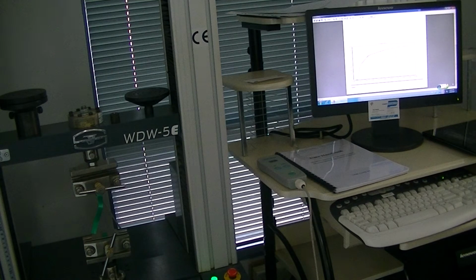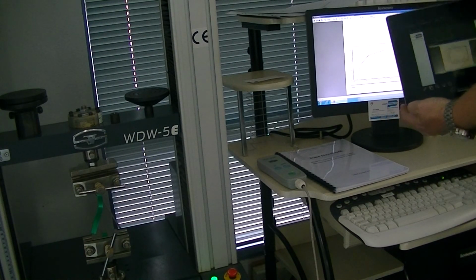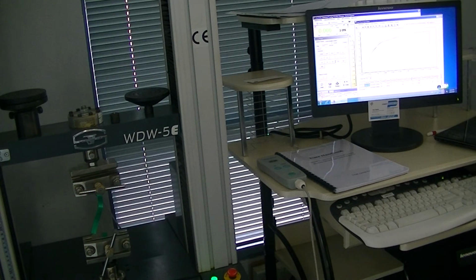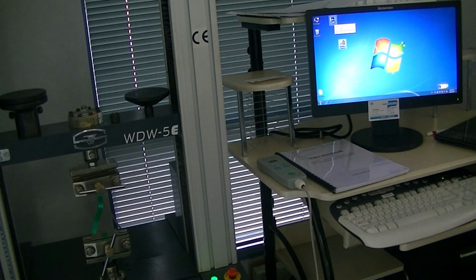So there we've just performed a complete test, a multi-batch test with auto save, auto return, all in a single operation, very fast and very smooth. We did that just then by following all the instructions on the PowerPoint presentation that has been sent to you. Also, that PowerPoint presentation is on your computer, on the supplied computer, right here under copy instruction. So if you get confused or a little bit unsure, you can then click on that and you'll have that there. Being a PowerPoint presentation, you will need to put PowerPoint on this computer to make it work. Otherwise, you can do it on your another desktop or laptop. But everything is there, easy to work and very simple.